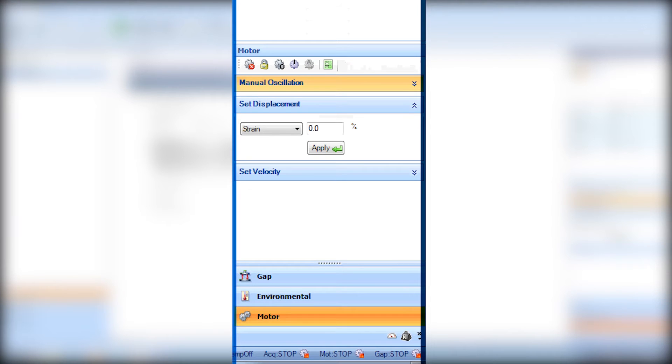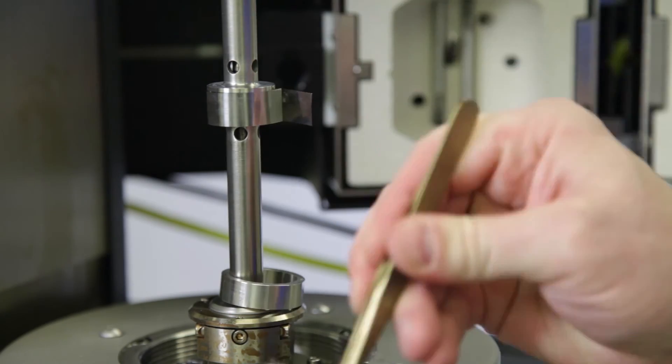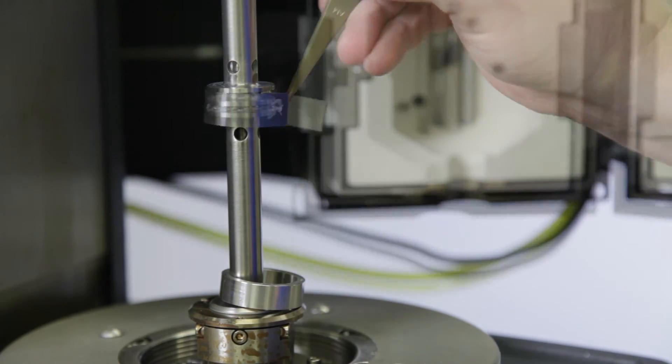Remember to first lock the motor. Then open the furnace and quickly remove the clip. The ring will fall, and with a pair of tweezers, remove the steel shim.